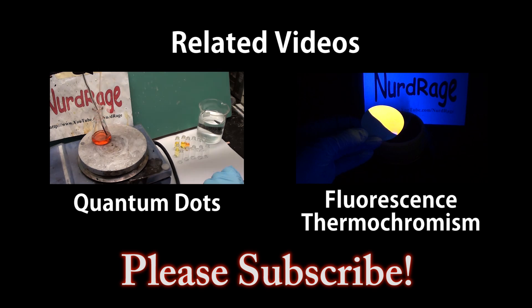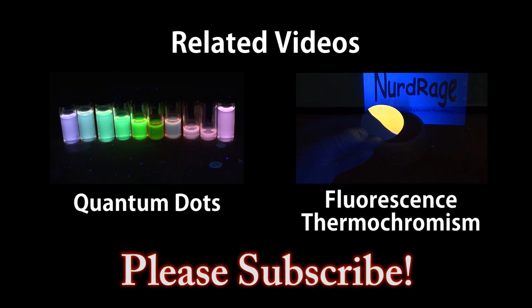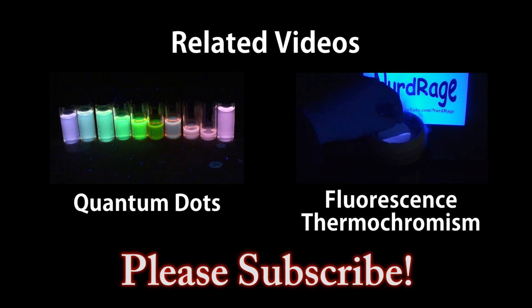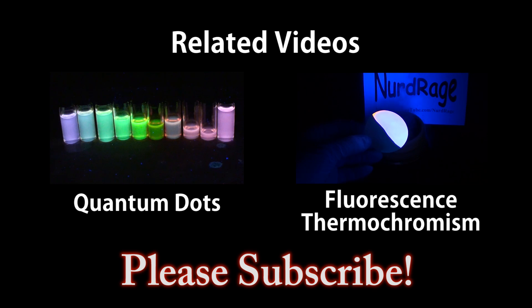In this video we're going to make cadmium selenide quantum dots, a type of nanoparticle with interesting properties. In this video we're going to demonstrate temperature sensitive fluorescence, also known as fluorescence thermochromism.